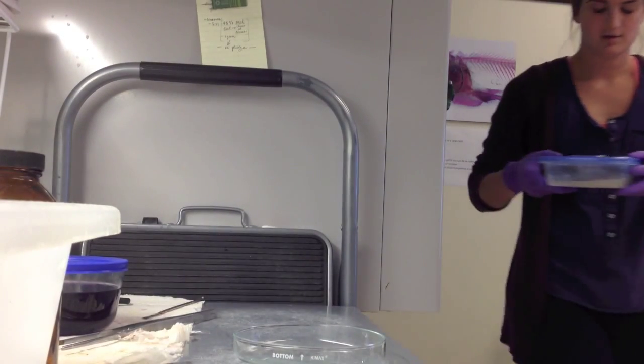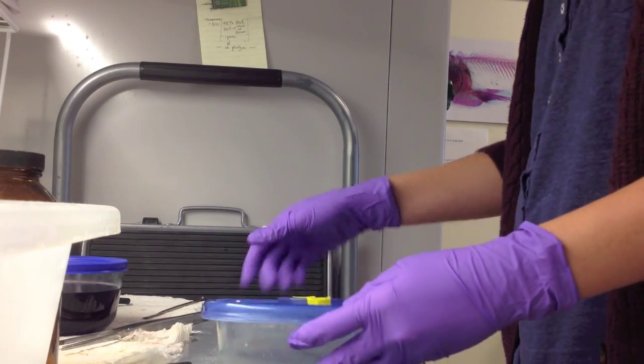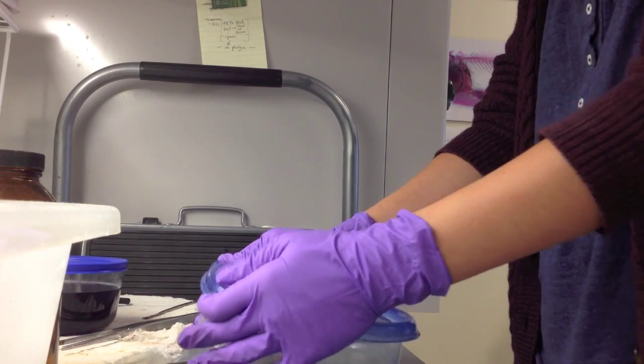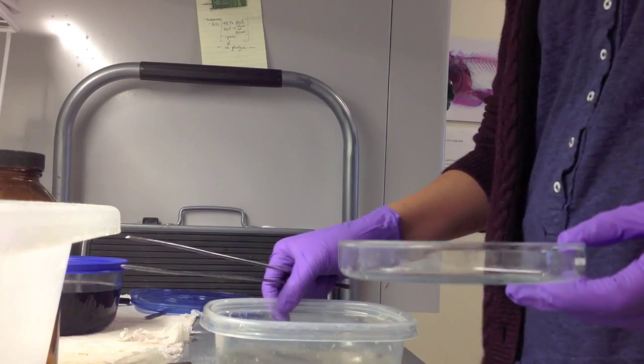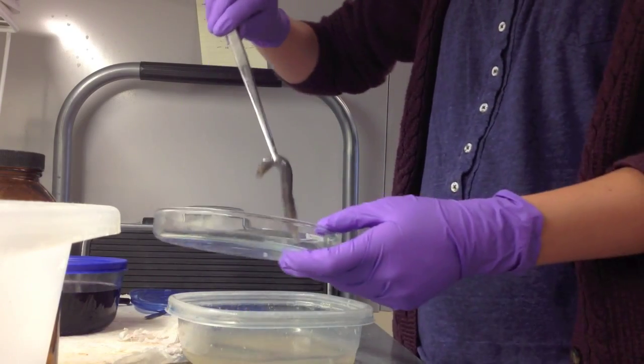Next, we place our specimens in trypsin. The trypsin solution is 7 parts distilled water, 3 parts saturated sodium borate, and 10 grams of trypsin powder per liter of solution. Trypsin is an enzyme that will digest the muscles of the specimen, so it becomes clear and pliable. We keep specimens in the solution until the vertebral column becomes visible.